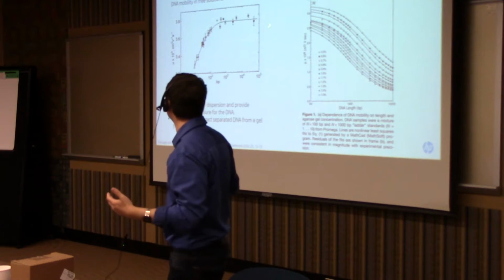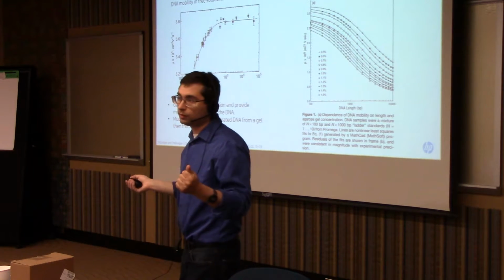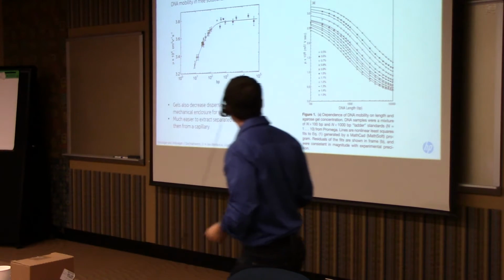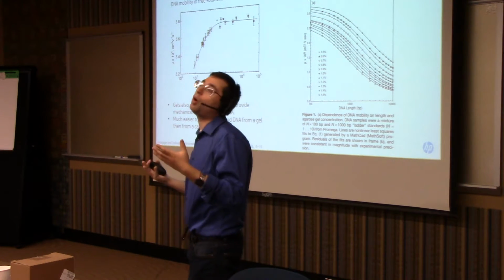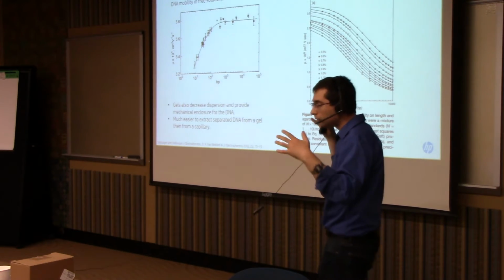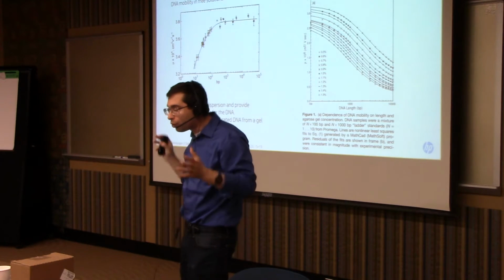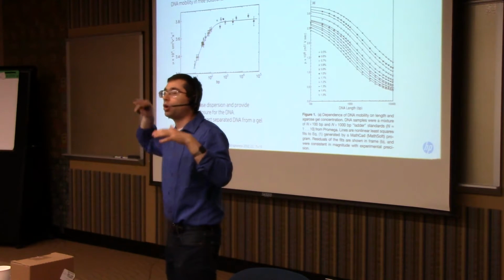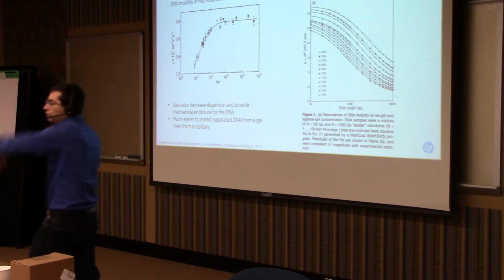Okay, so you want to separate DNA in these lengths, so what do you do? What you do is you take this polymer, which is your DNA, and you put it through another polymer, which is this gel, a matrix of polymers. So as it's traveling through this gel, it is often forced to uncoil itself, at least partially, as it weaves through the fibers of that gel.